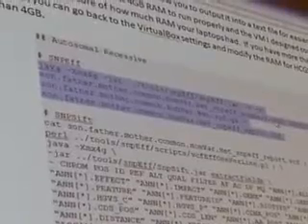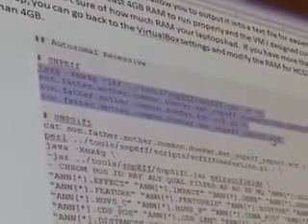Okay, so at the end of the day, when you run this command, you're going to generate an HTML file, and you're going to generate a VCF file that will have annotations. And let me open up. Over here is this HTML file that SnpEff creates, telling you the command that you ran, but it also breaks things down.